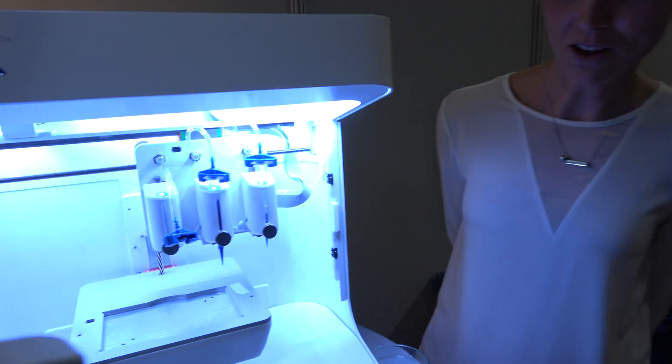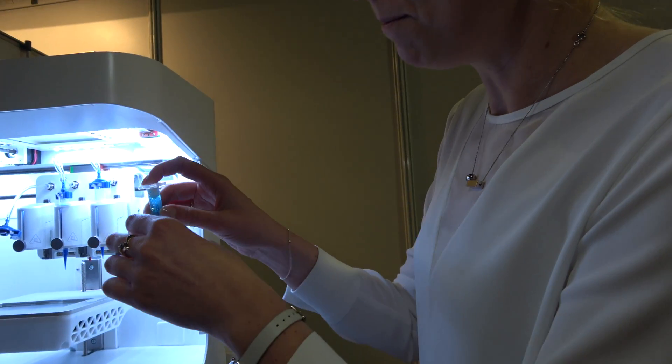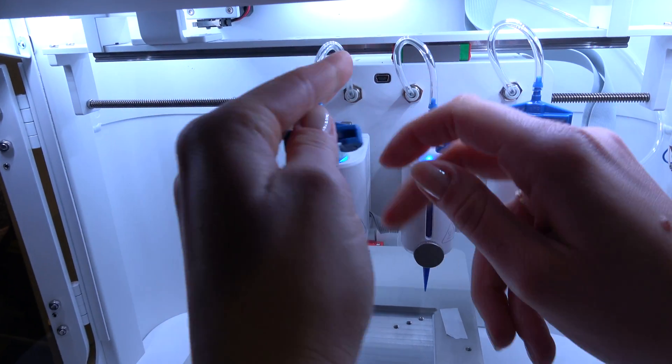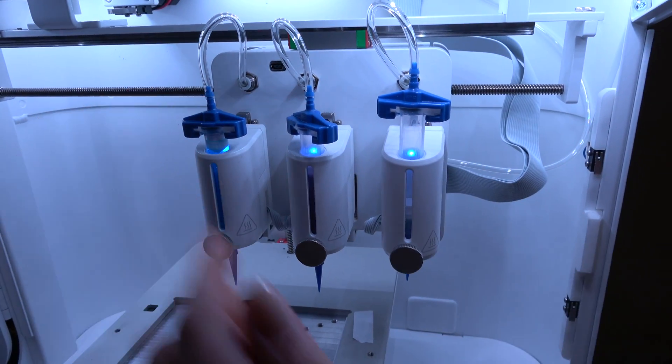I'm going to show a little bit on how the printer works. What you start with is a mixture of your cells together with a bioink or a biomaterial. Then you just place it into the printer, attach the air pressure, and then you're done.